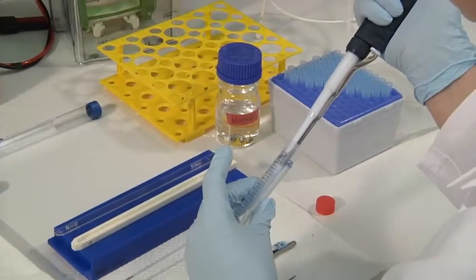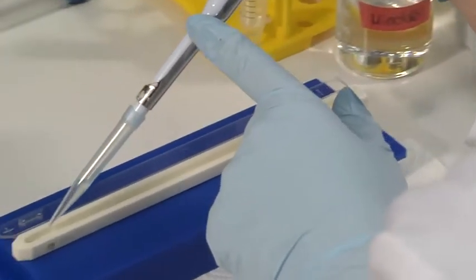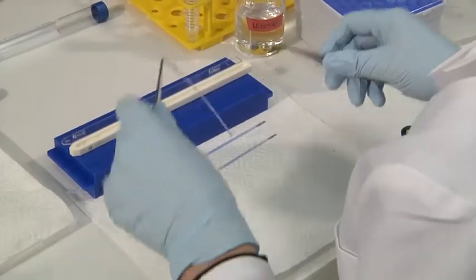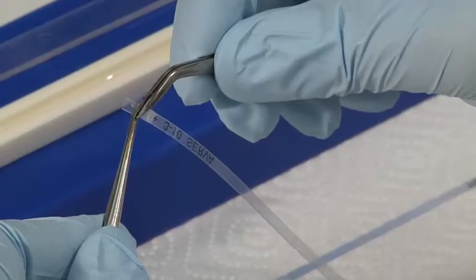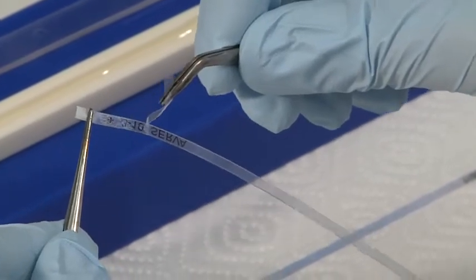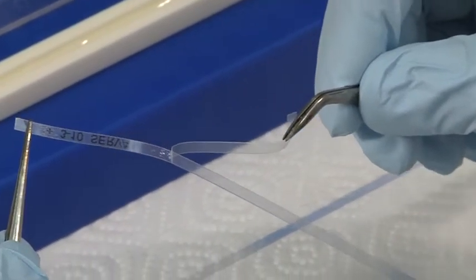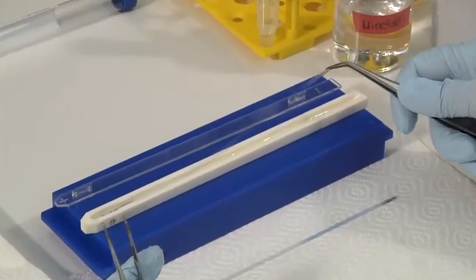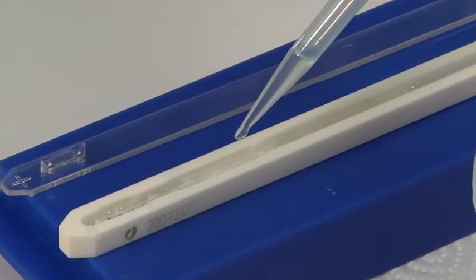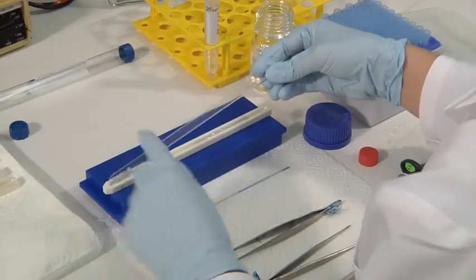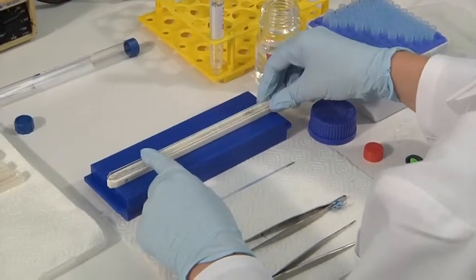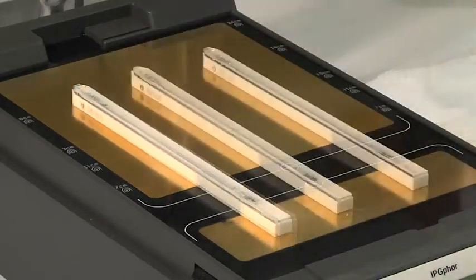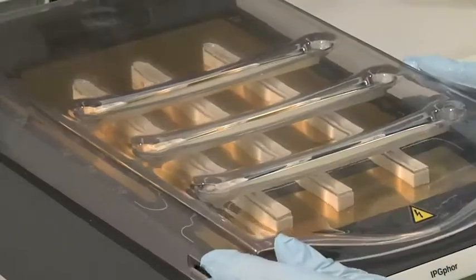The second method starts with the first one-dimensional separation, called isoelectric focusing. For this, we use an immobilized pH gradient gel. The IPG strip is put into a case, which is then filled up with mineral oil. We close the case and transfer it to the IPG phoresis machine. This approach separates proteins by their different isoelectric points.